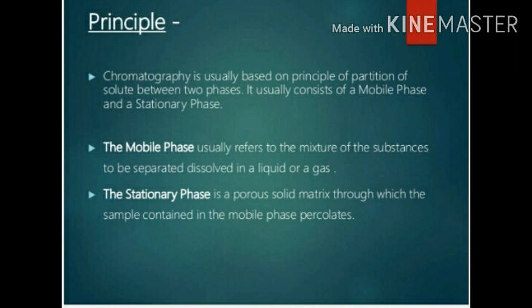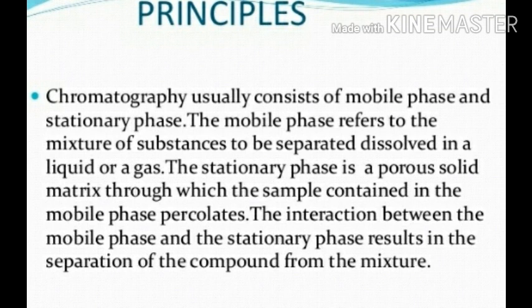Chromatography is usually based on the principle of partition of solute between two phases. It usually consists of a mobile phase and a stationary phase.